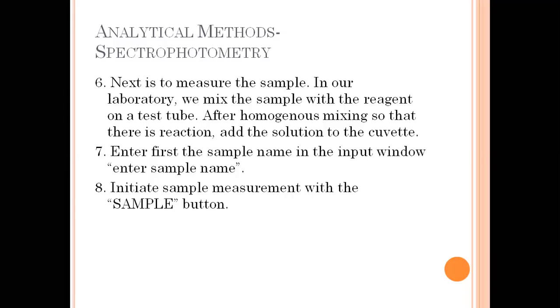So in CC2, when we have face-to-face, you will get your equipment from the counter. Usually, what will be given to you are test tubes, pipette tips, and the standard solution, if you are the group that makes our standard measurement, and many more depending on the test or what we are measuring for that day.